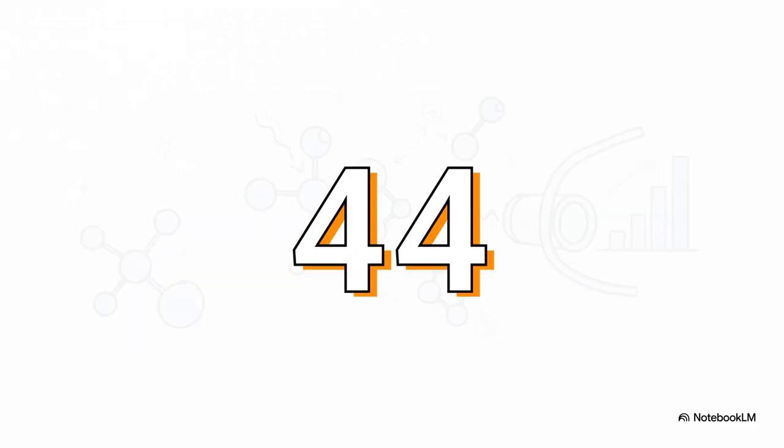44. I really want you to remember this number. In the mass spectrum of valeraldehyde, 44 is the exact m/z value of the base peak. Why? Well, because that fragment is the direct result of a McLafferty rearrangement. Seeing an intense peak at 44 is a massive forensic clue that you are looking at an aldehyde with a chain of at least 3 carbons attached to the carbonyl. It's a real game changer when you're looking at a spectrum.